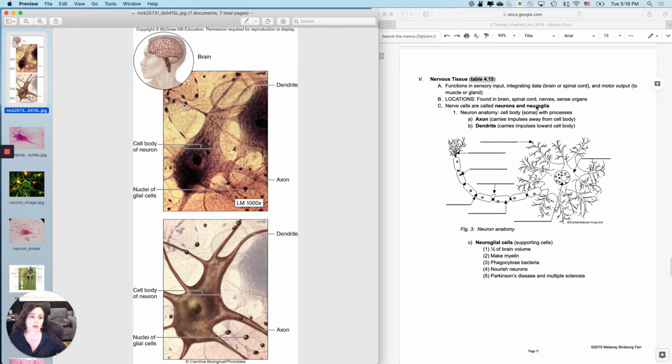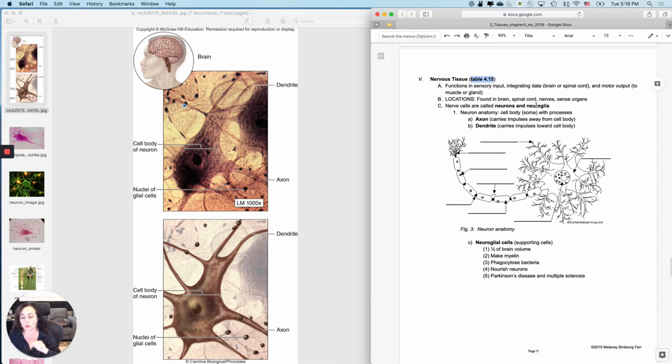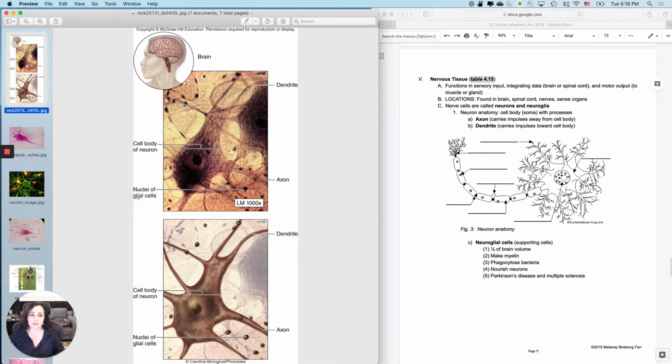Those are either called neuroglia, as in nerve glue, glia means glue, or sometimes just glia. So the terminology of those, neuroglia is multiple neuroglial cells. Neuroglial cells is another way to say it. Glia or glial cells is also fine. So we named those when we thought that they were basically just space fillers for the superstars, which are the neurons. So when you look at neuron anatomy, you basically have this big starburst shaped cell.